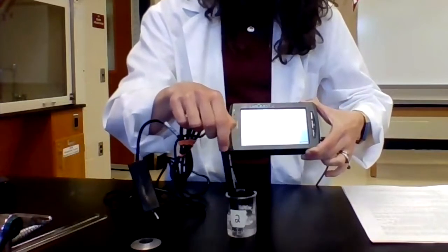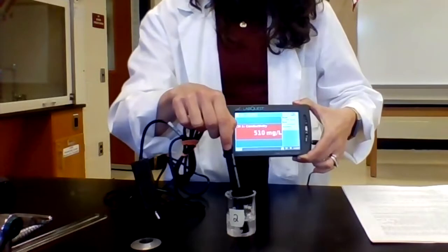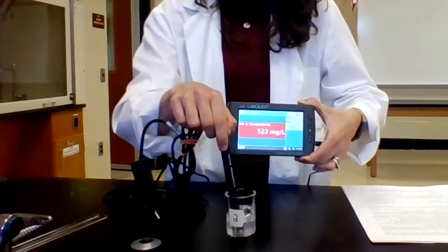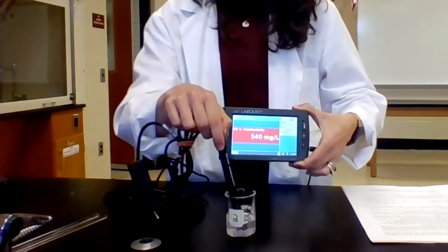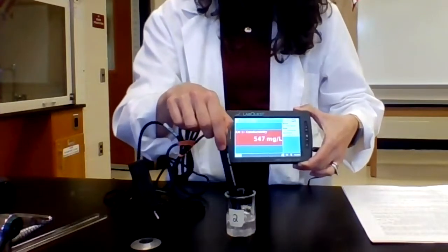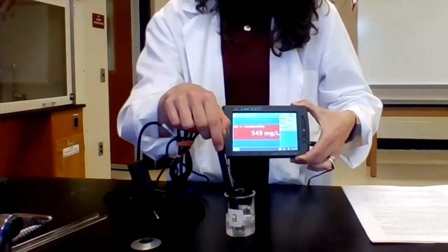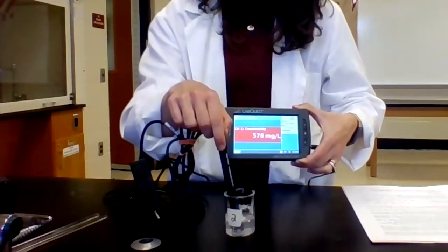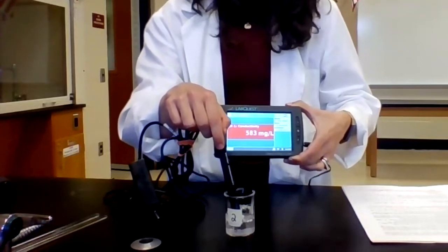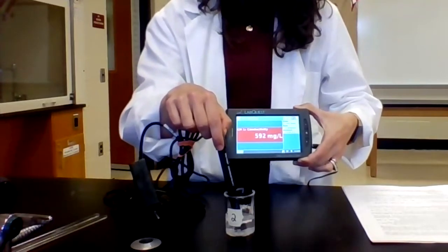You can see that the number will kind of fluctuate a bit. We're really not interested in the precise number. This is a qualitative lab, not a quantitative one. So what I'm more looking for are differences between the different solids. So I see that this does have a little bit of conductivity here. It's certainly not 0, but it's nowhere near the 16,000 of solid 1. So most likely solid 2 is going to be polar covalent.